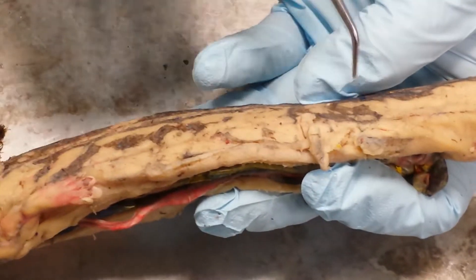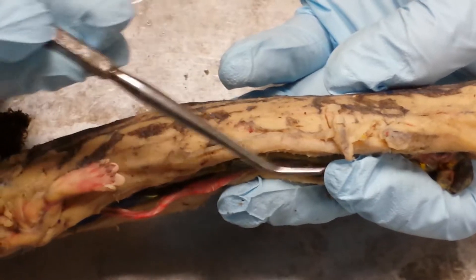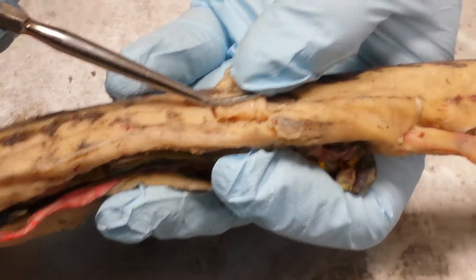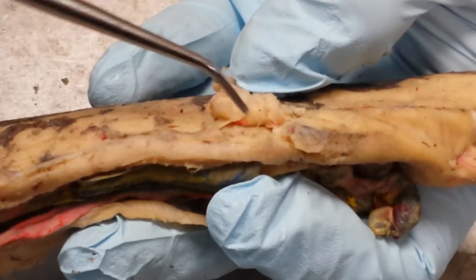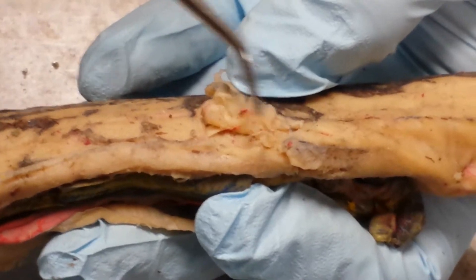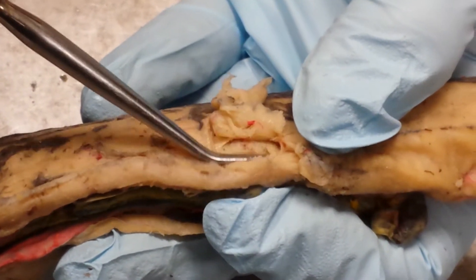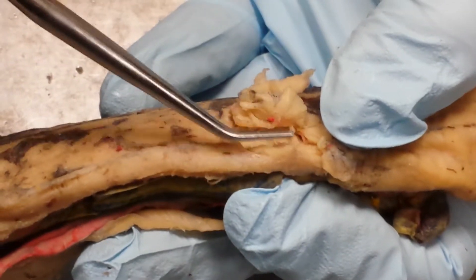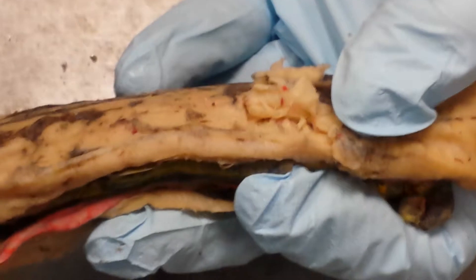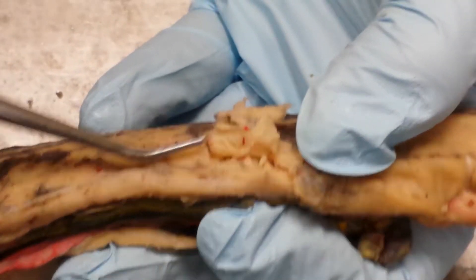When you make a little window on the side of your salamander, you'll see that there are three layers of oblique muscles. The topmost layer is called the external oblique. The middle layer is the internal oblique, and the deepest muscles are called the transversus abdominis.